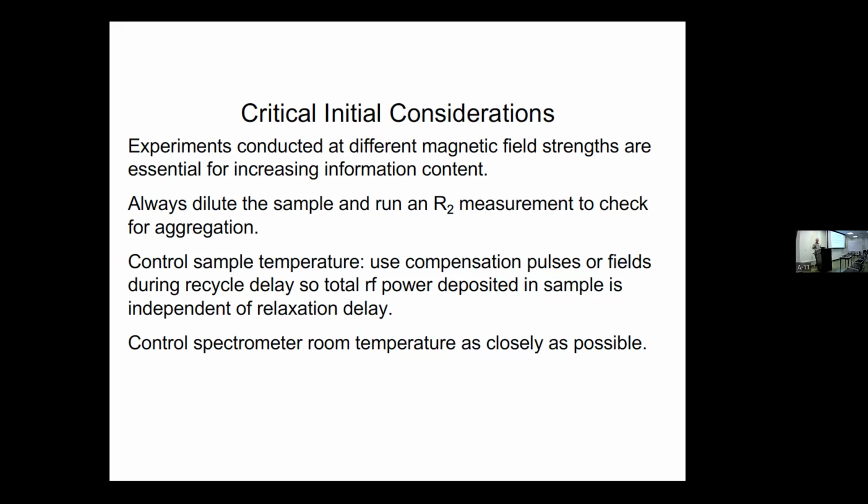About the VT here itself? That usually goes through a pre-cooler and then is heated back up. That should be taken care of. The input temperature shouldn't matter very much. When you're tuning and matching a solid state probe, what do you care a lot about?